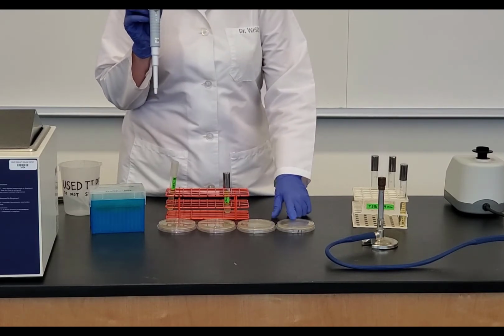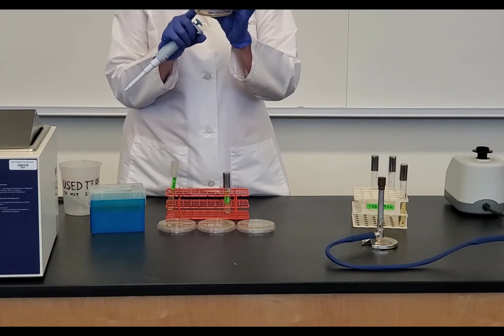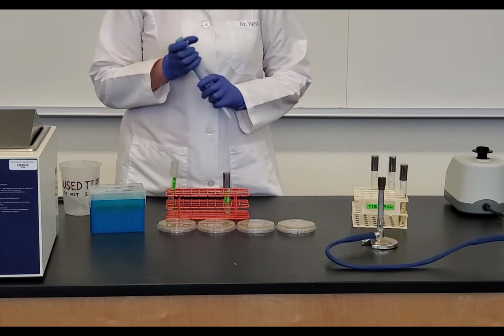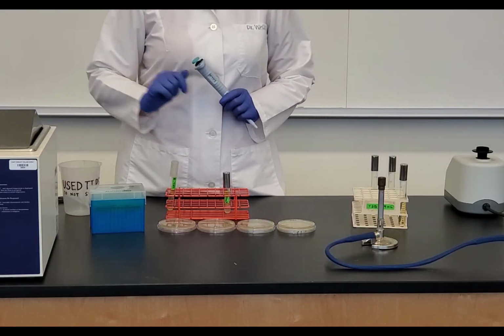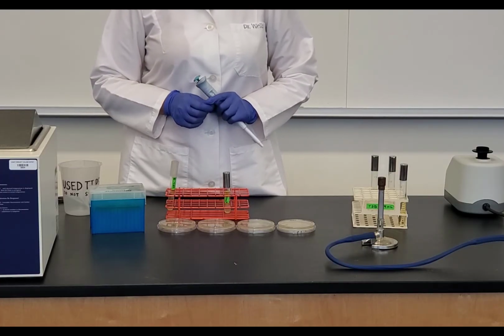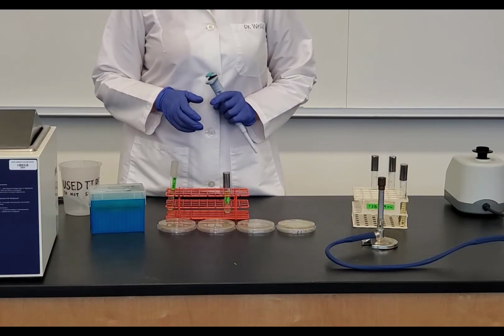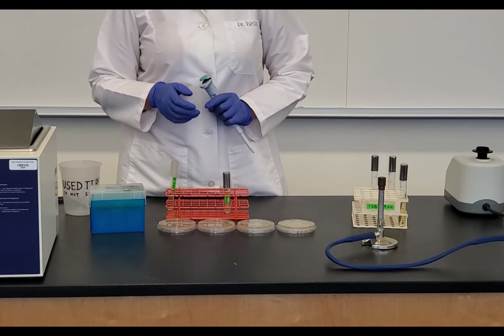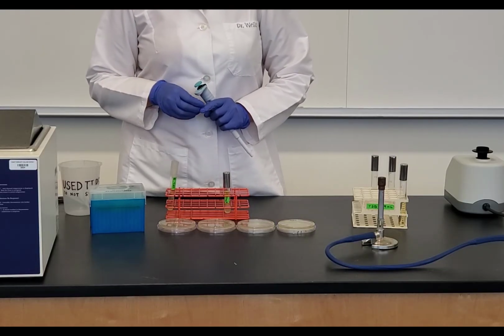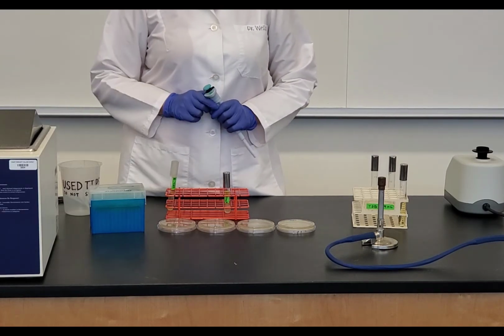Now, when I do this, these are thin plates. They're thin agar plates. So what I have to do, just like in my standard plate count, I have a melted agar deep. And my melted agar deeps are kept in my water bath, and they're kept at 55 degrees. And the reason for that is that the 55 is going to keep it a liquid. When the temperature gets down to 42, that agar is going to solidify. And so I need to keep these in the water bath until I'm ready to do this.